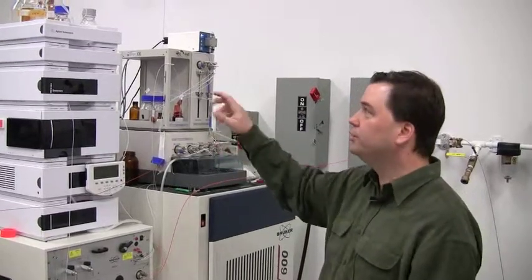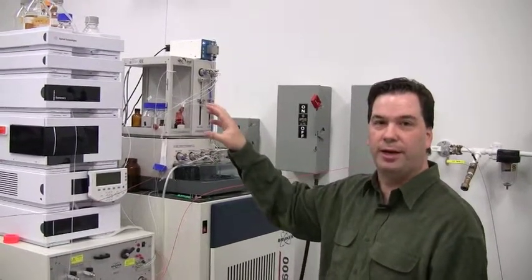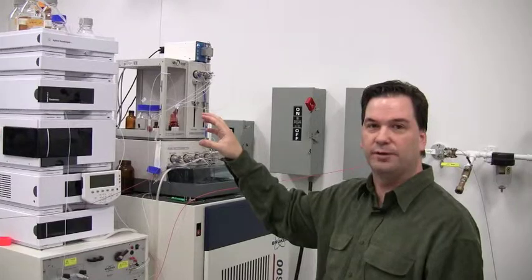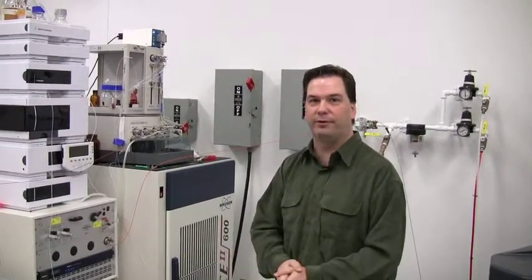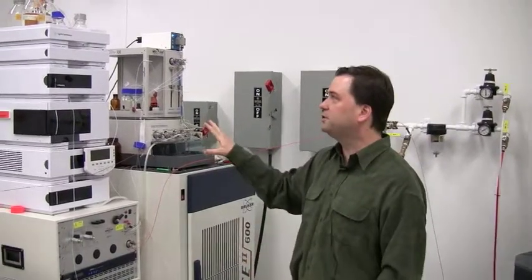At that point, we could use protonated HPLC solvents. Whereas in the case of going directly from the HPLC to the NMR, we're restricted by having one of the solvents, namely the aqueous phase, having a deuterated source in it. And that could be expensive if the runs get to be very lengthy. By going to the solid phase extractor, we could use traditional proton-based or protonated solvents.